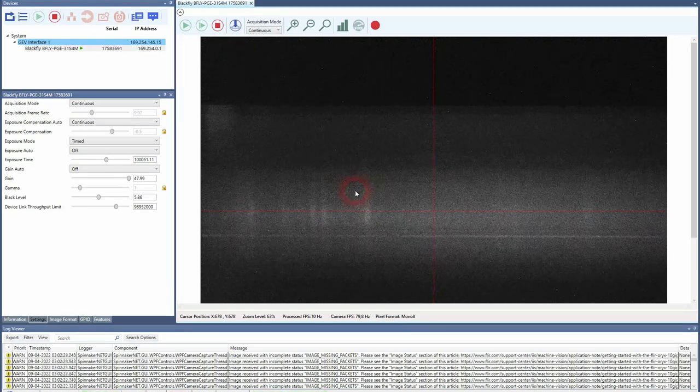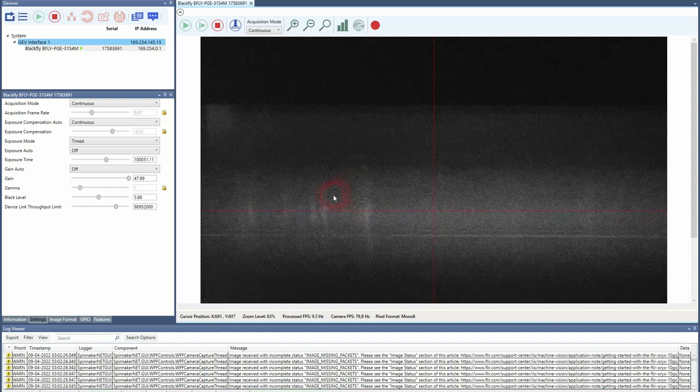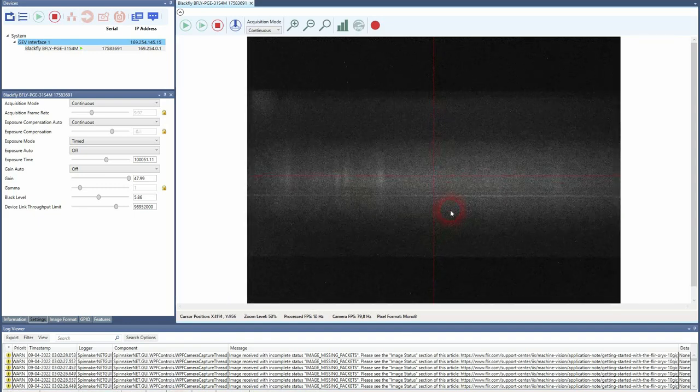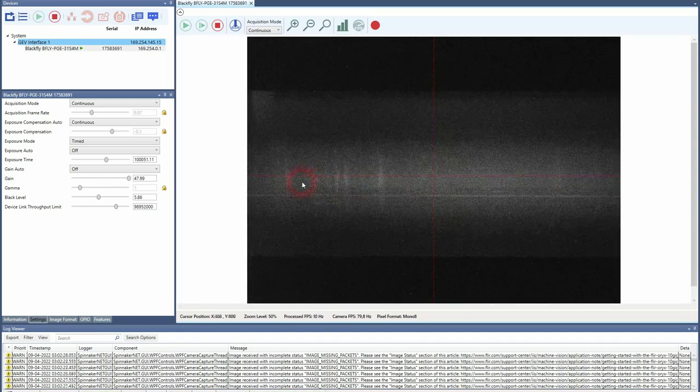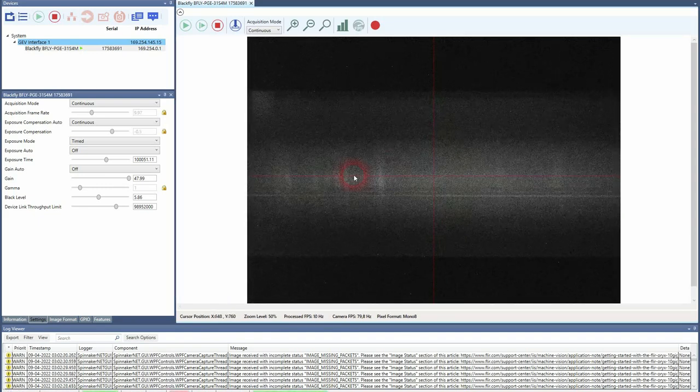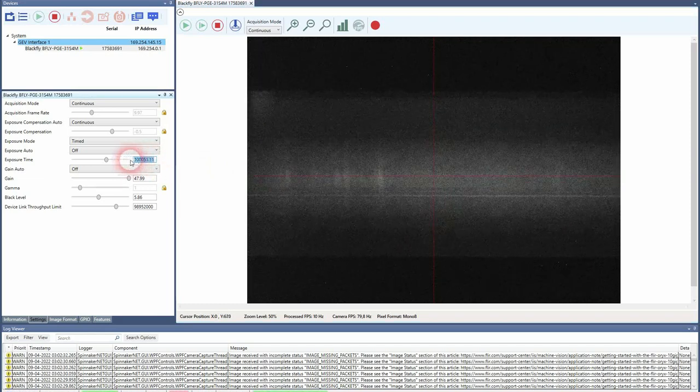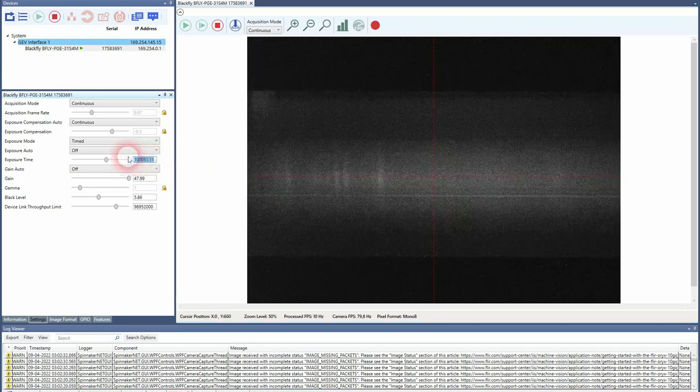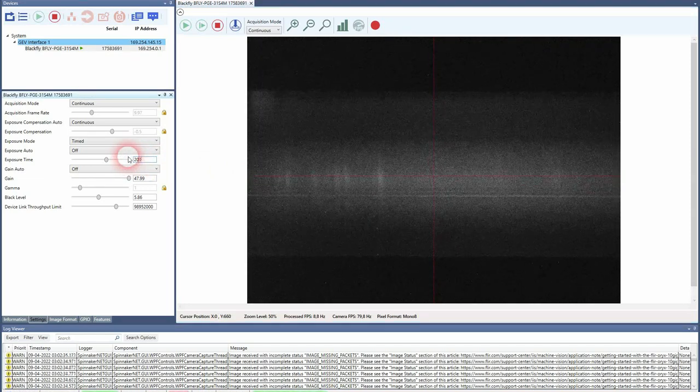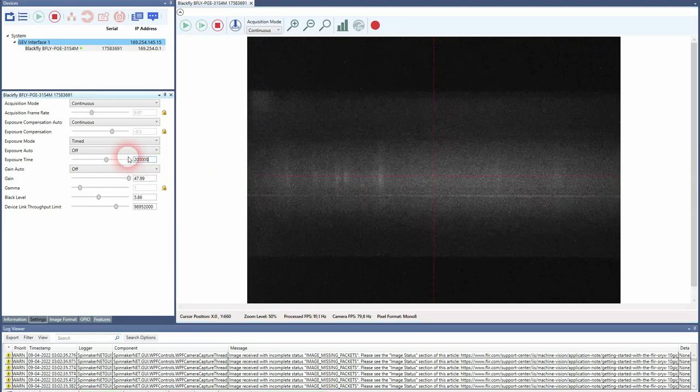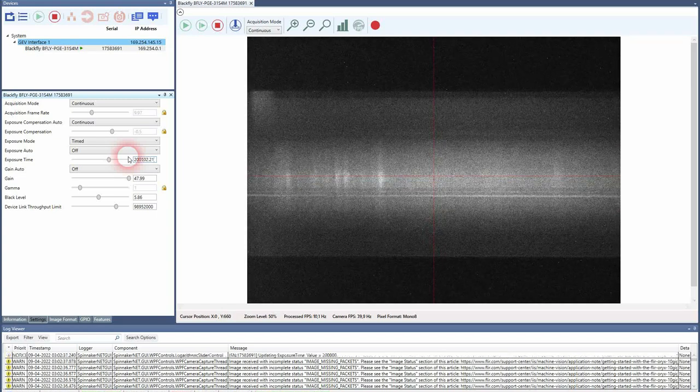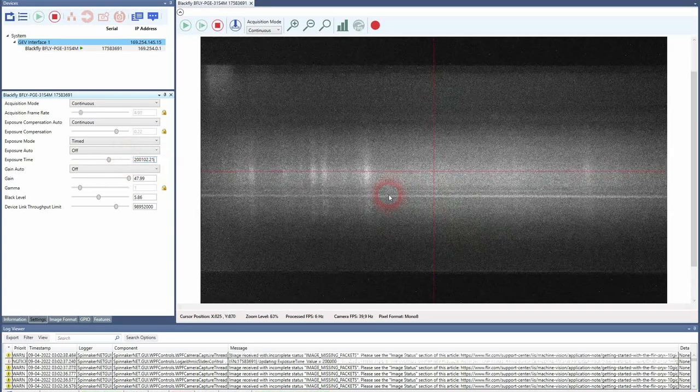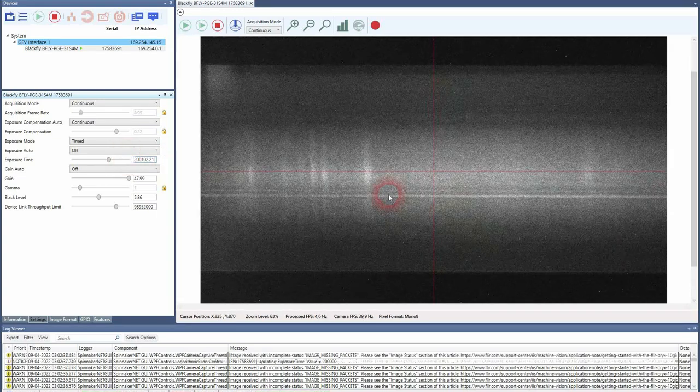So what we currently see here is the Raman signal of the salicylic acid. So I will just increase a little bit to 200 milliseconds so that we better see the signal.